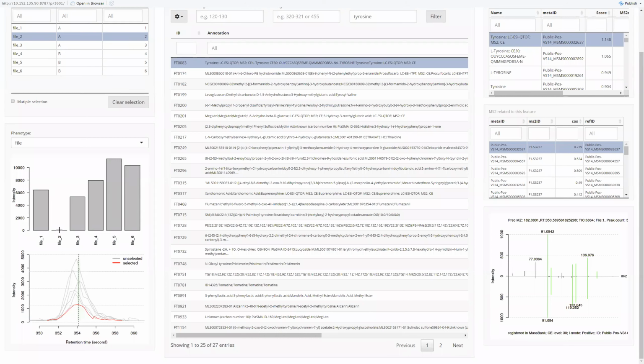In this case, the intensity is 0 because the height of the peak is too low. We use the threshold 1000. At least 5 data points have to be higher than 1000 in an experiment to identify a peak. But maybe this peak, unfortunately, doesn't cross this threshold. So the intensity here is 0.